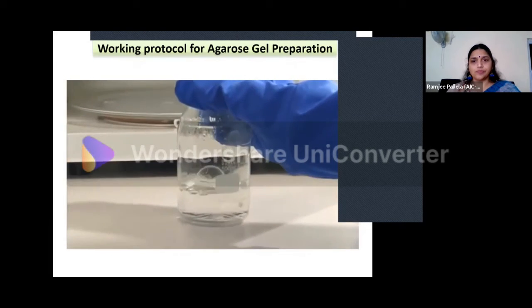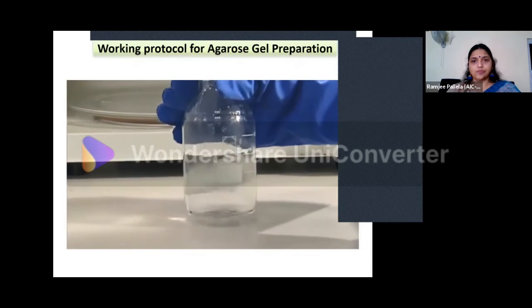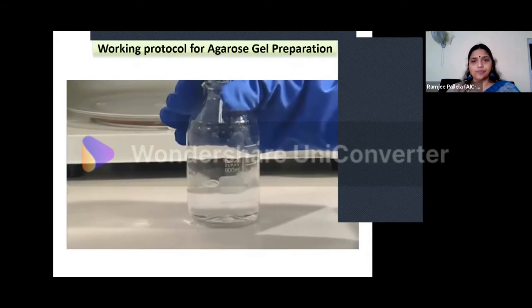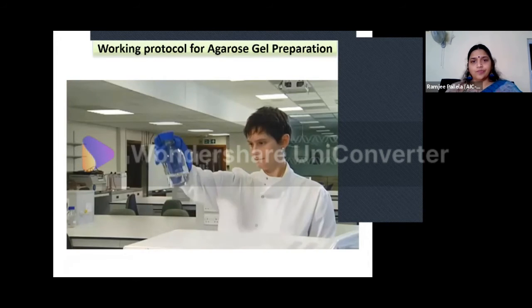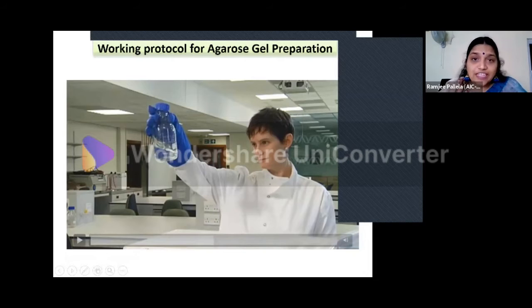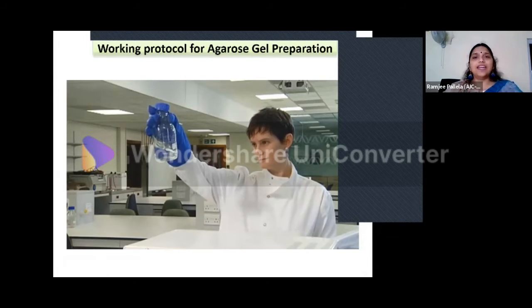Once the agarose is fully dissolved, let it cool to 60 degrees Celsius. This prevents heat damage to the gel tray while keeping the agarose liquid. Now you may ask, how do I know when it has reached 60 degrees? It comes with experience. Frankly speaking, there is no rule or chart for it. So it comes with experience.